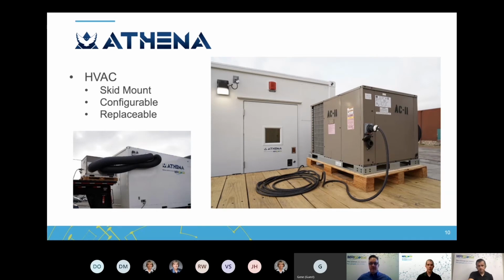There are some trade-offs to doing that type of setup. It certainly can be done. We primarily use this approach for serviceability of the HVAC system itself, so you don't have refrigerant running through a split pack system. We went with this approach purely from a maintenance and serviceability standpoint. But really, it's just a box, and so you can cool it in a number of different ways. Yeah, the one thing I would comment is that the split unit off the side, you'd have to remove it and replace it after transport. I see that as just a complication, but it certainly is doable. Go ahead and go to the next slide.